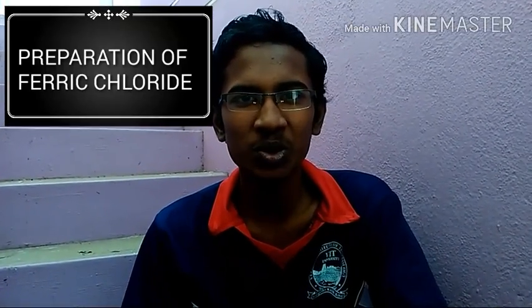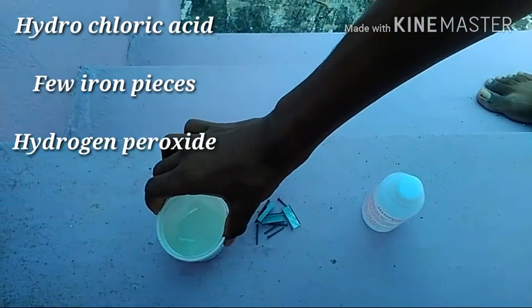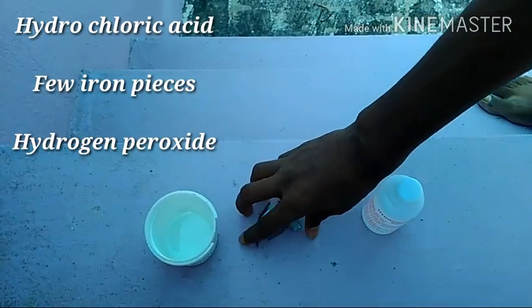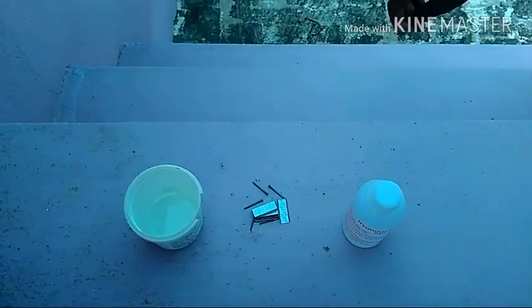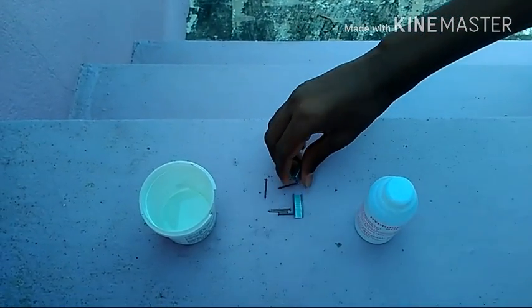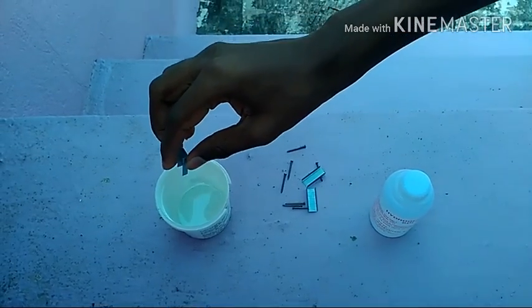Hello everybody, in this video we are going to see the ferric chloride preparation. We need 2N dilute hydrochloric acid, a few pieces of iron, and an oxidizing agent hydrogen peroxide. First, let's add some iron pieces into the 2N dilute hydrochloric acid.